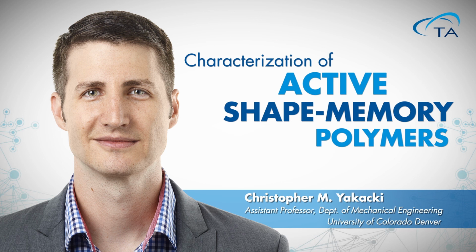The other thing is make sure that we're not applying a very high dynamic strain. Just because a material is brittle doesn't mean it can't undergo some strain. It just means it can't undergo any plastic deformation. So what I would suggest is put your strain amplitude, or your dynamic amplitude, down. If you read a book about DMA, I think Kevin Menard wrote a nice one, he says never go above 0.2% dynamic strain. So if your material is quite brittle and can't undergo a high amount of strain, I would recommend getting it lower, 0.1 or even 0.05.